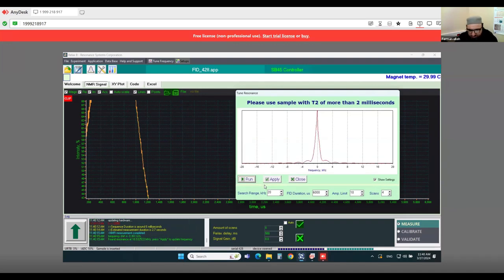Okay. So I see the other equipment using our collaborator party. They are good in signal, but our machines need sometimes. This also depends on a few parameters which can interrupt the centralizing. First of all, maybe the sample temperature: the temperature which we are giving from outside and the inside temperature are not uniform, so it may interfere, and maybe this is the main factor.